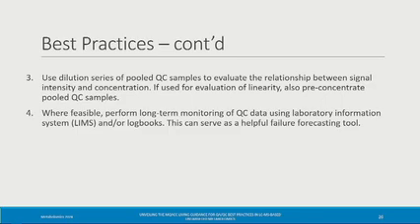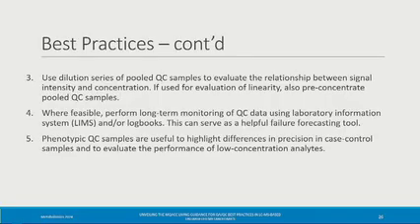This can serve as a helpful failure forecasting tool. The fifth best practice is that phenotypic quality control samples are used to highlight differences in precision in case control samples and to evaluate the performance of low concentration analytes.